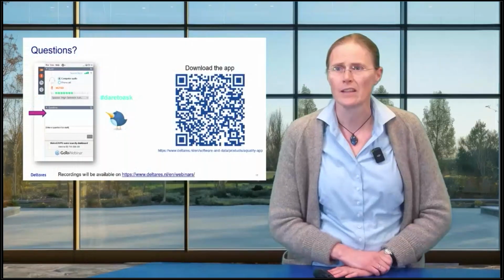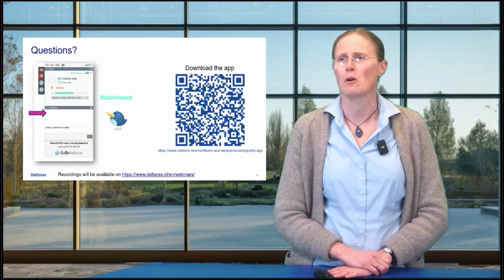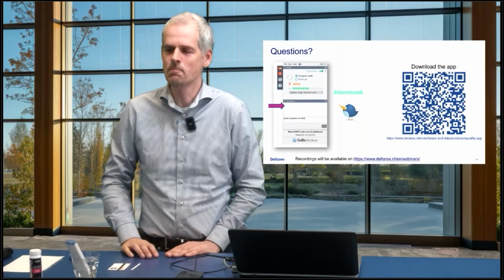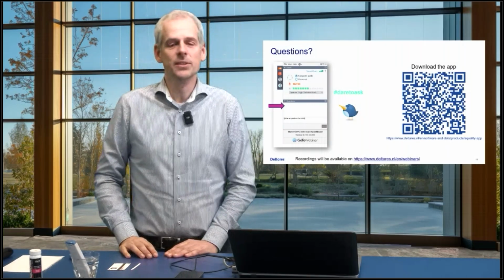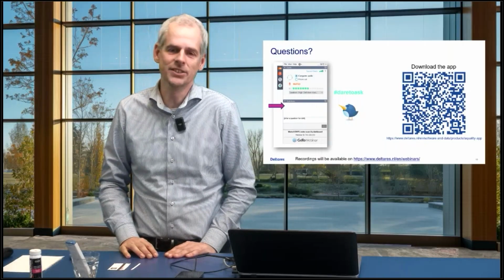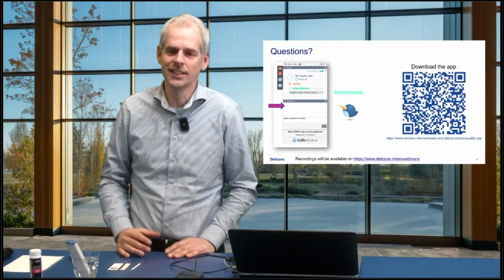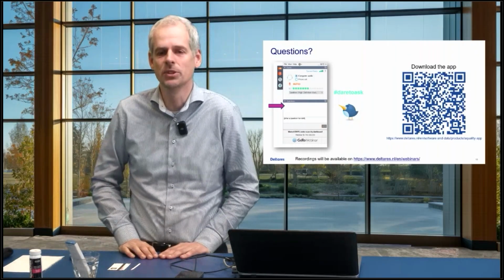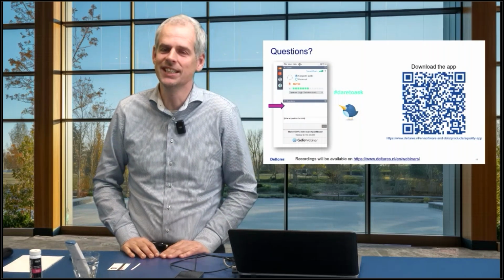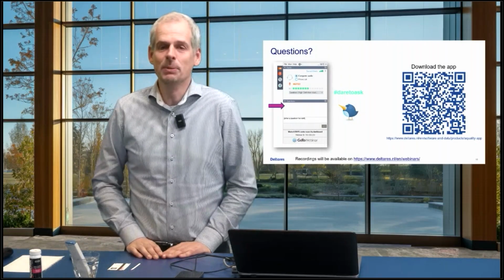Then is there any advice for how users can do dilutions when measured concentrations are above the instrument threshold? That's a very good one. No, actually, we haven't really got specific instructions for that. Of course, it depends on how high it is. If you can just mix it 1-to-1 with nitrate-free water, for example, you would have to do the manual input then, I guess, because the concentration that you get from the app has to be multiplied.